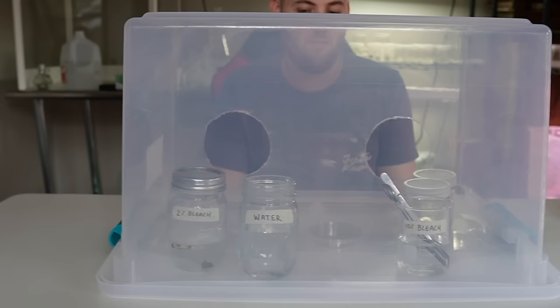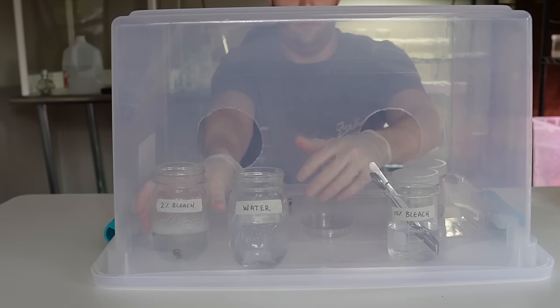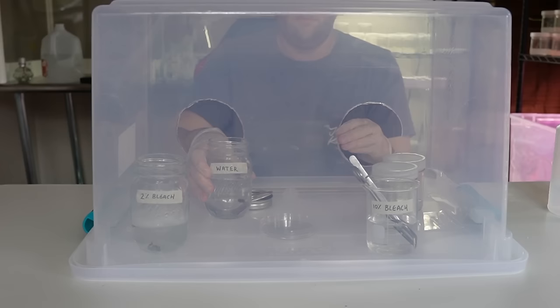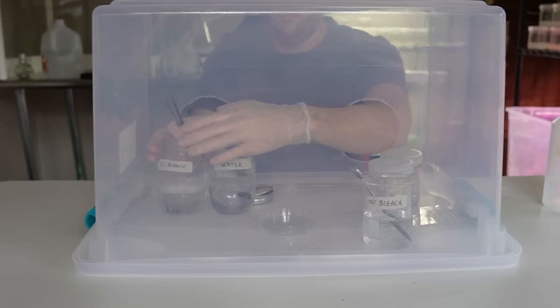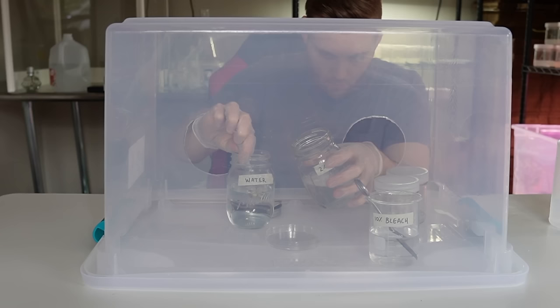The first thing we're going to do is open the jar containing the explants in 2% bleach. Use the forceps to take each explant out of the jar, open the petri dish, and place them onto the sterile petri dish. Then dip them into the distilled water before placing them — this rinses off the residual bleach and dish soap left from when we decontaminated them.